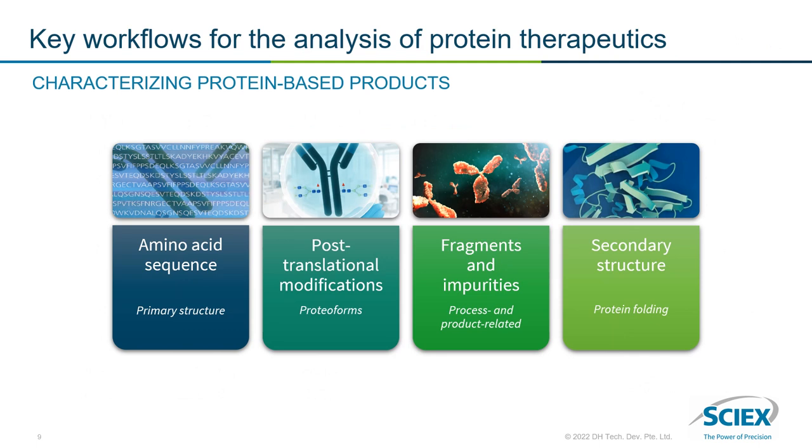At this point, we're going to transition into some of the workflows that you can implement to characterize the various attributes of proteins, and we'll focus on these workflows here.